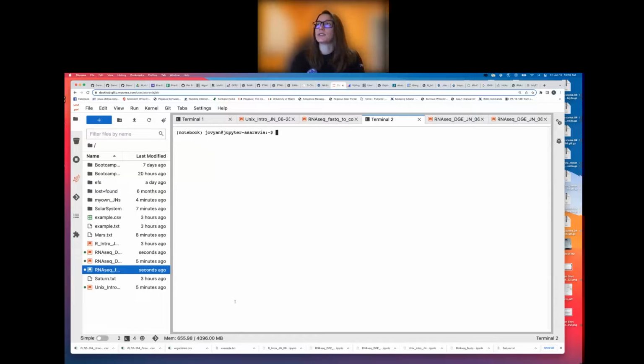And I want you to first see where you are in your terminal. What command do you use to see where you are? You guys type in the chat. Yeah, Mark, pwd. So I want everyone to write pwd and make sure you are in your home directory, because that's where all the notebooks are that you've been working on.